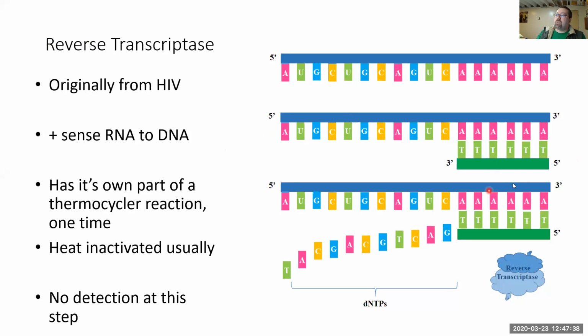Okay, so most RNA that goes through RT-PCR will have this poly A end to it, kind of like a poly A tail. It actually is very much like a poly A tail. So there will be this primer of DNA that will attach to that and start as a place for the reverse transcriptase to sit down. So what you can do for this is either have a global primer that will just start at all poly A tails and this primer will attach, or you can have a very specific primer that will be for your own specific RNA of choice.